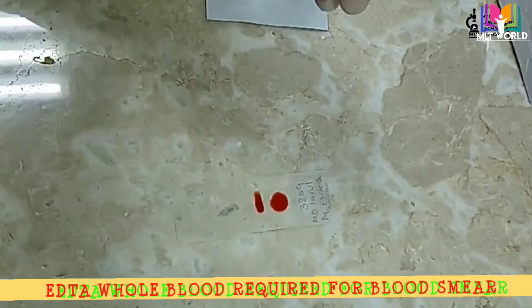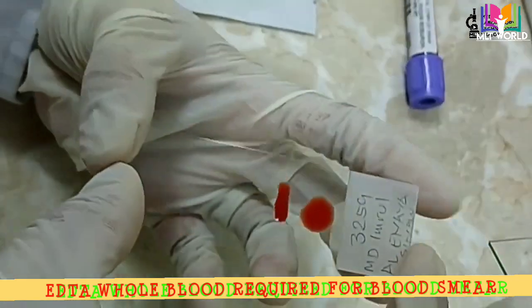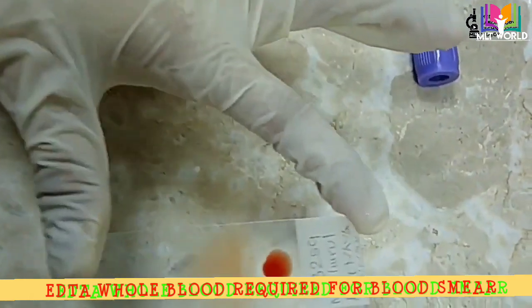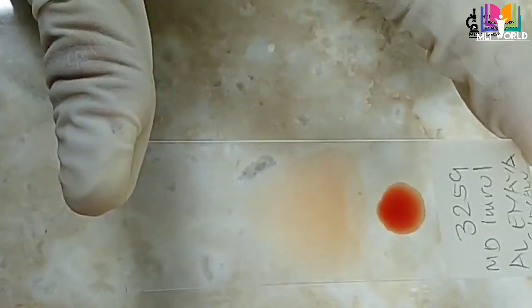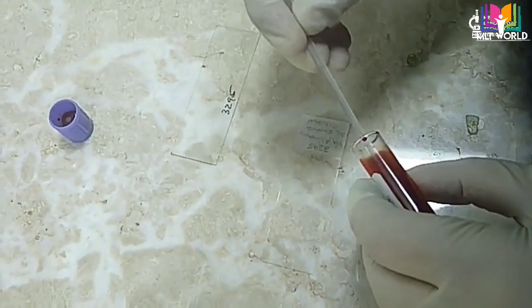Now there are two methods to make a thin smear. In the first method, you keep your slide in that position and move forward towards you, and the smear is ready. You can see this smear has a nice, beautiful tail and body.